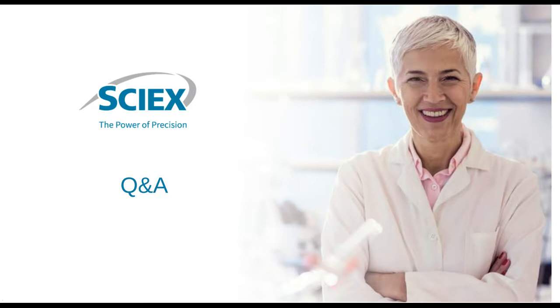Very good. Thank you. The next question, let's see, that's related as well. Let's move on to this one. Is it possible to use the ZipChip for nucleic acid analysis and interactions between proteins and nucleic acids? I am honestly not sure. I have not looked into that, but I will get back to you with an answer on that. That's great. Thanks, Whitney.